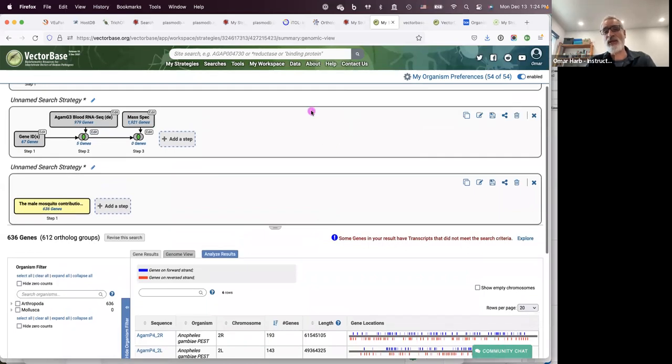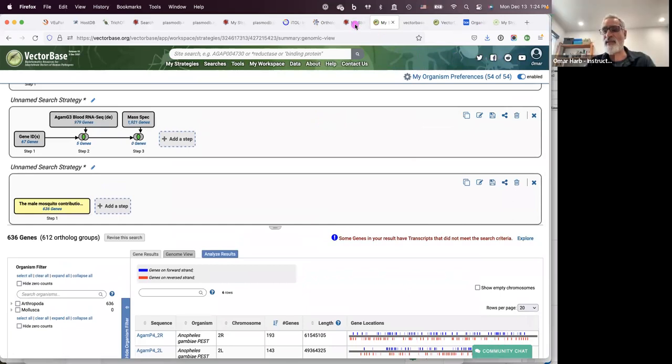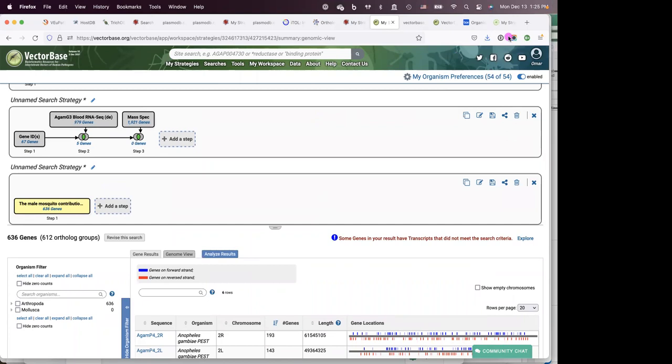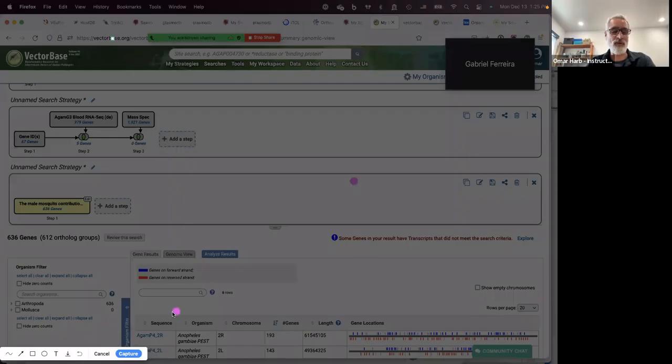Yeah, and with Leishmania you can do it as well, but again, just as a reminder, this will not be statistical, because there are methods out there for doing statistical clustering, right? Just because genes are close to each other on a particular chromosome, it doesn't mean that that's significant, right? But I'm just interested in location. Yeah, so absolutely.